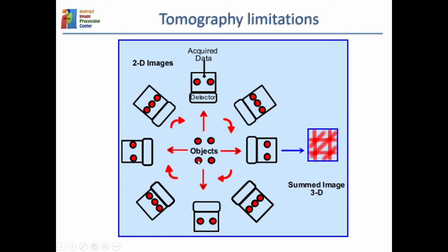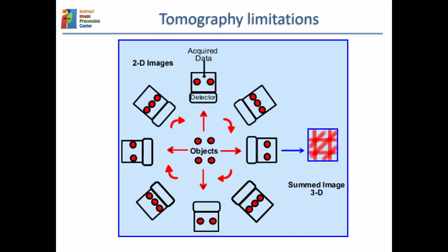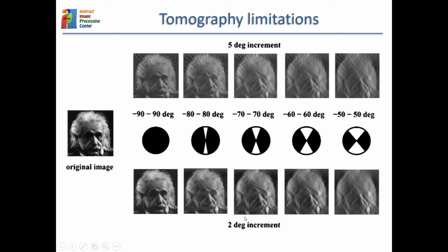So we cannot distinguish only from these projections which of the two originated these projections. The assumption that we were making at high school was that our object was compact, so the compact object would be this one. But otherwise, this object is also compatible with our measurements.